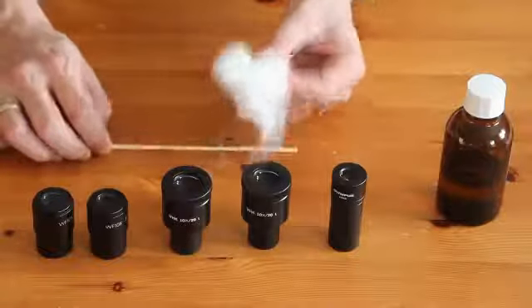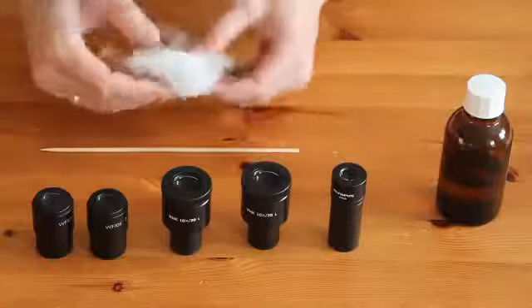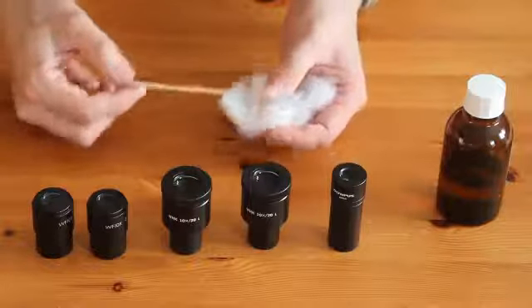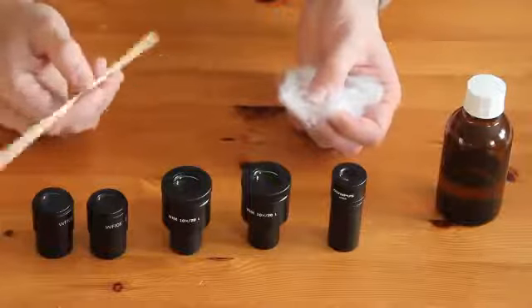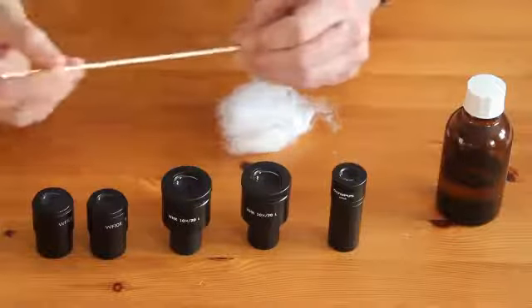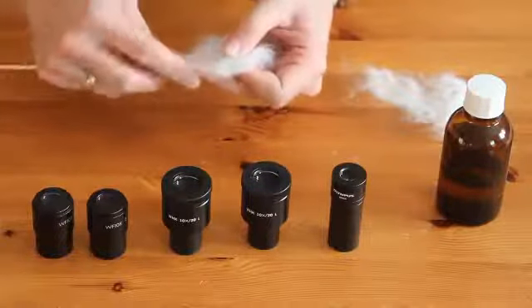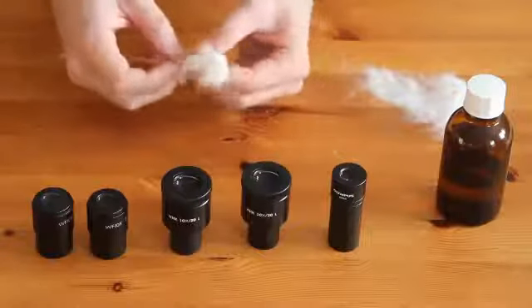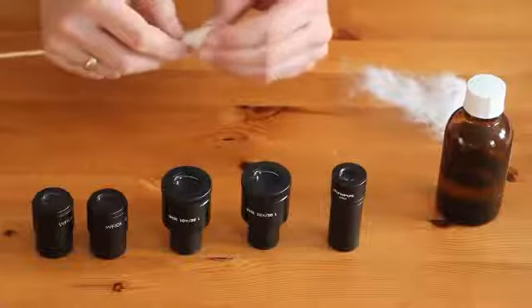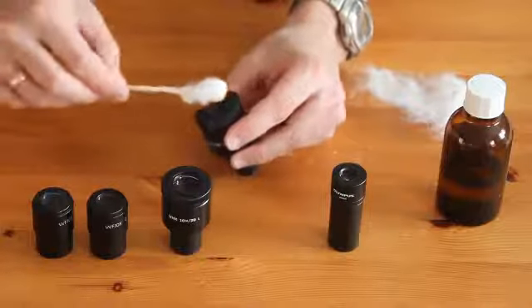Over here I have some regular cotton, and this is what I'm going to use. It is pure cotton with no additives, no powder or anything included — pure cellulose cotton. What I'm going to do is wrap some of the cotton loosely around a little wooden stick. I bought them in a supermarket; they are actually used for barbecues, for putting little meat and vegetable pieces on. I wrap some cotton loosely around this wooden stick, giving me a very lightly wrapped, loose cotton swab which I can use to clean the optical surfaces.